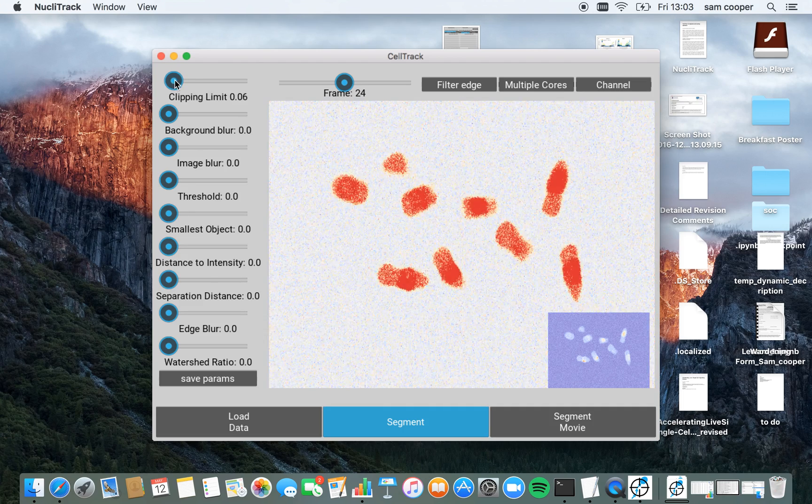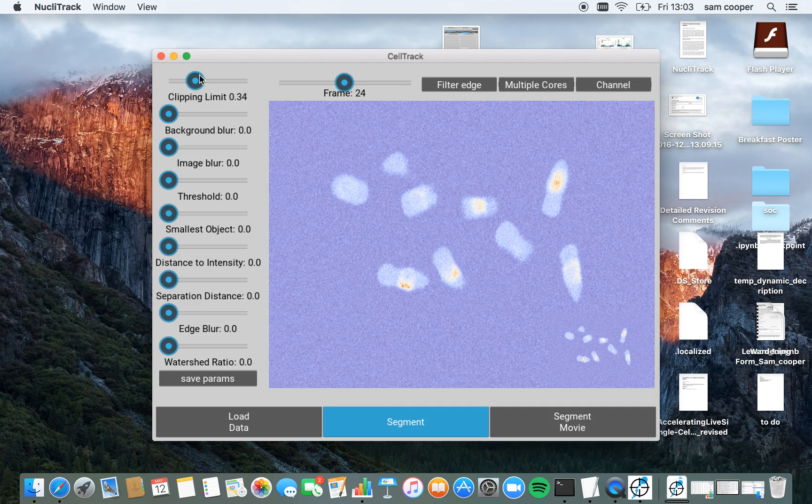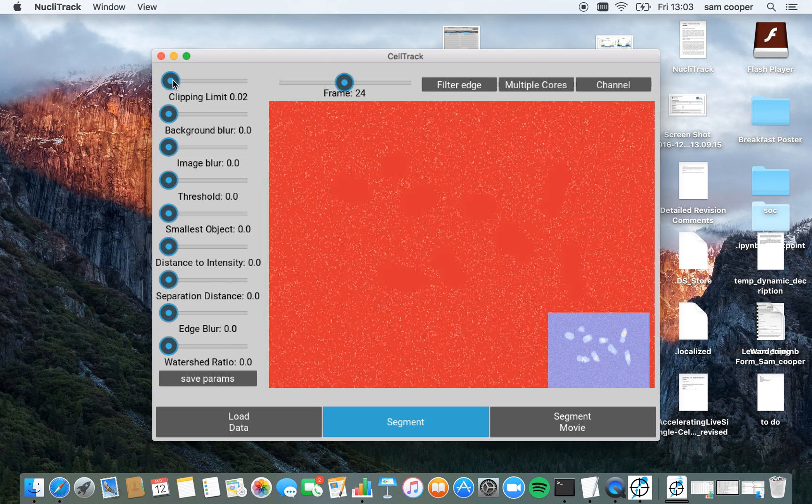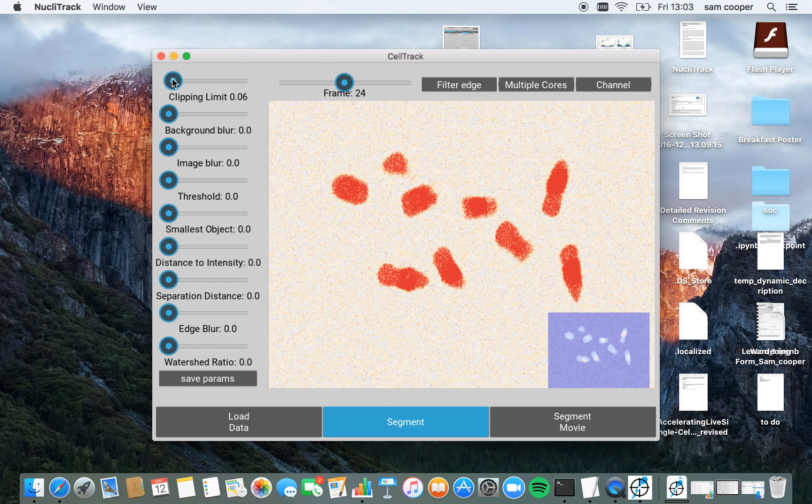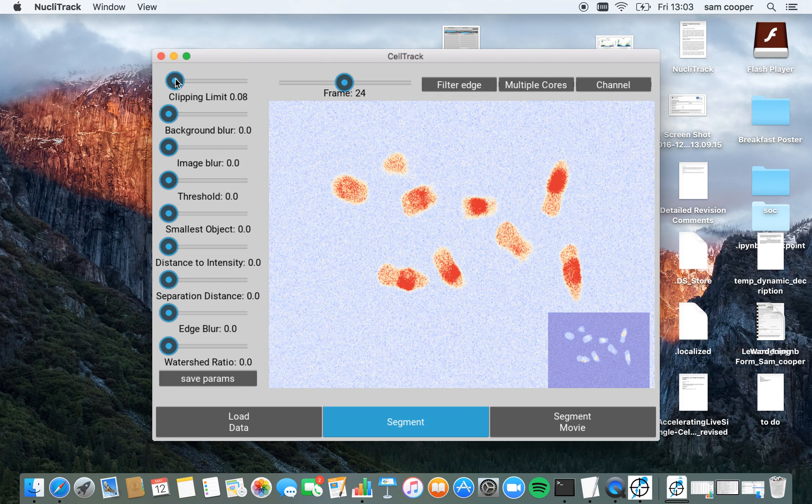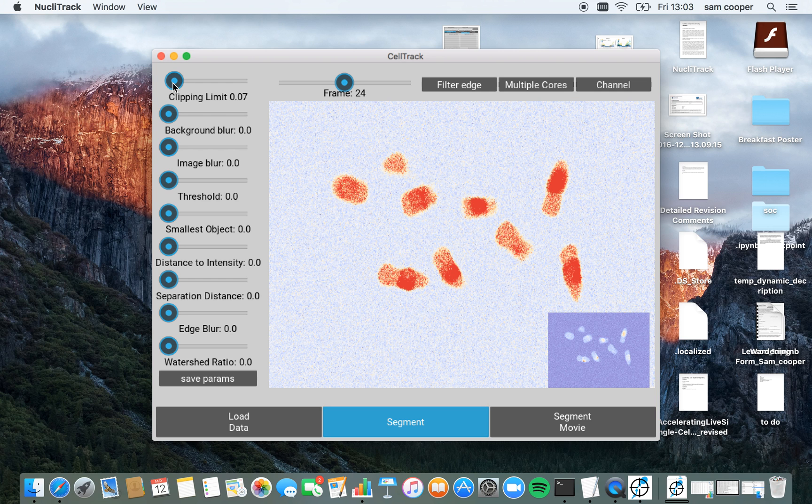The clipping limit allows me to basically choose what the maximum pixel intensity I want to work with is going to be. I'm going to select this to about 0.07 here. This nicely highlights the nuclei.